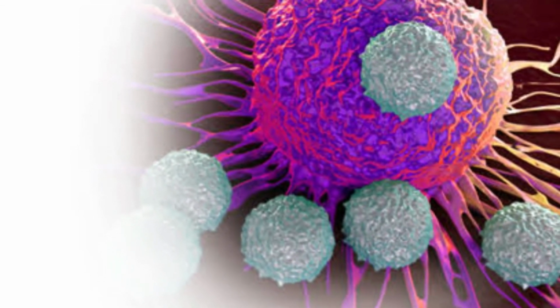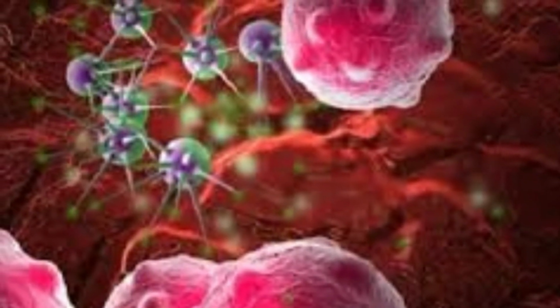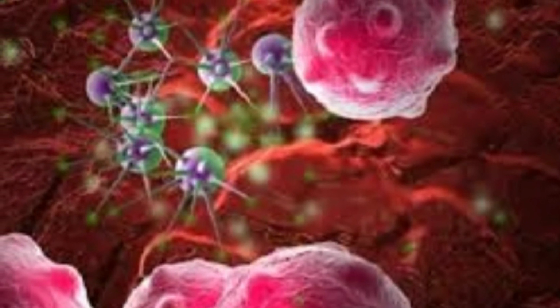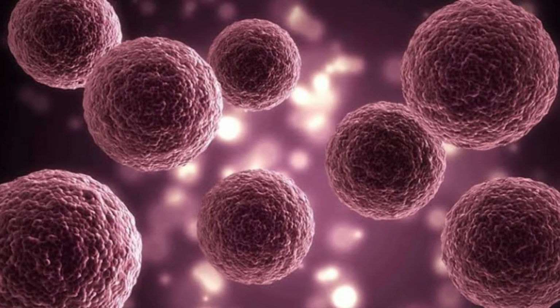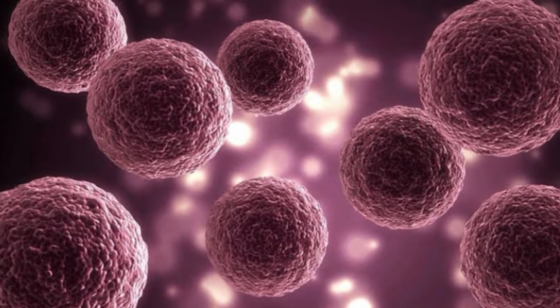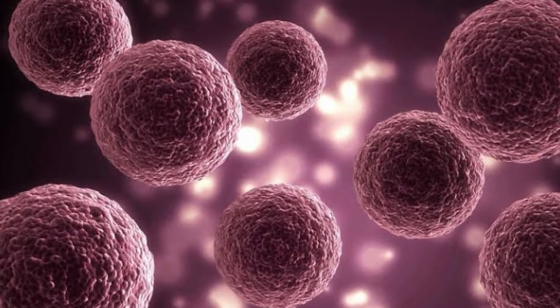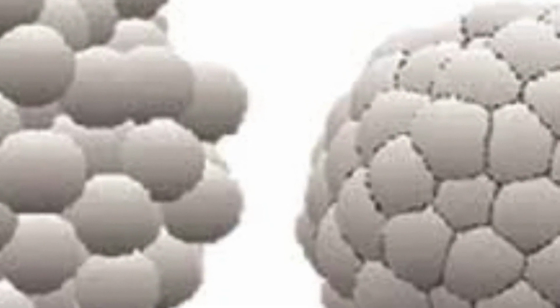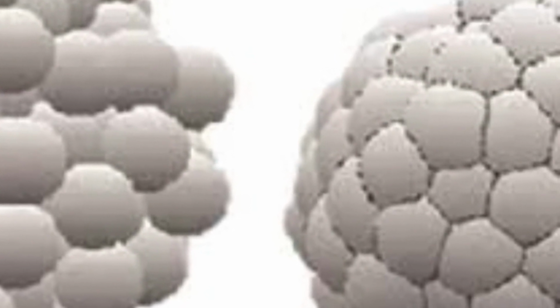Precise placement of spheroids also allows creation of heterocellular tissues like bone. By beginning with human mesenchymal stem cells, the researchers found that the cells differentiated and self-assembled bone tissue. The ability to produce artificial living tissues is valuable in areas outside of regenerative medicine. Frequently, tissue samples are necessary to test drugs or screen other chemical products. Producing specific tissues for each purpose could help in these endeavors.